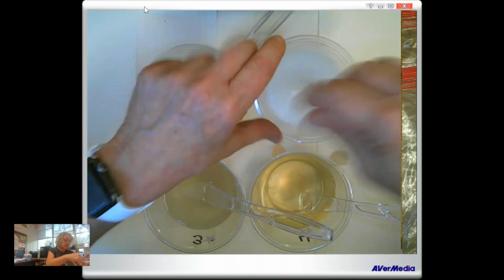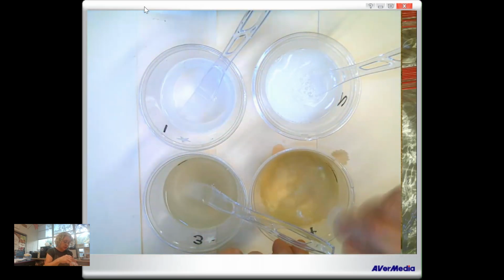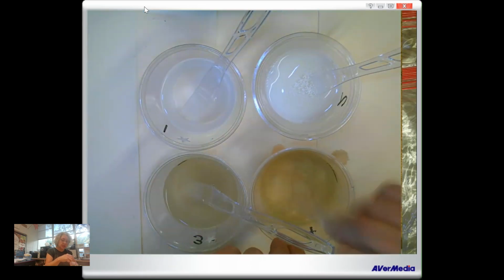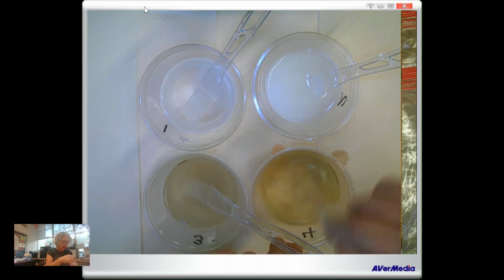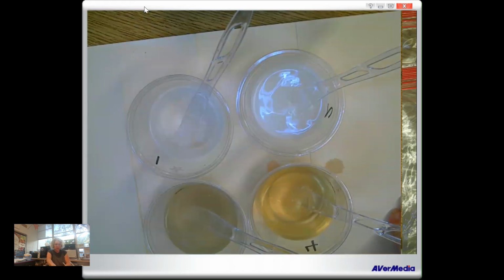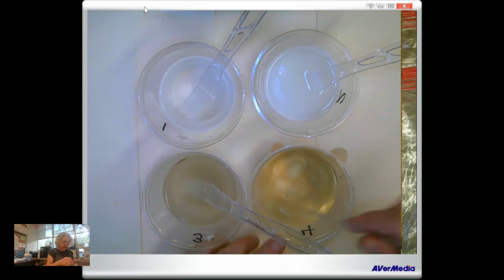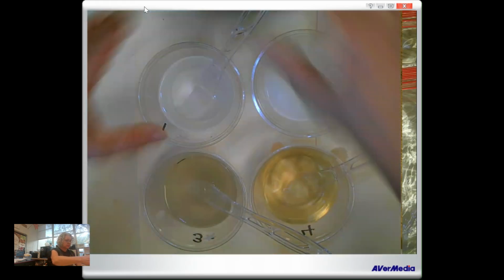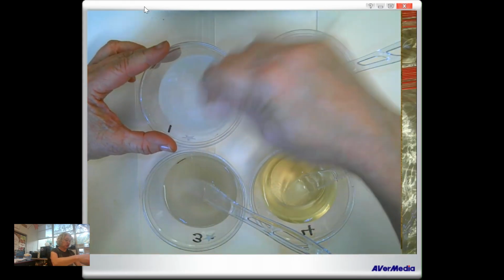Come on, 2. See, when we were in class, the kids did all this hard work for me. La la, should I sing a song? I should have prepared that ahead of time, right? What would be a good dissolving or stirring song? I can usually think of a, oop, I'm spilling. Don't spill, Miss Man. Keep it clean. All right, nothing's coming to mind. A song about stirring. No.